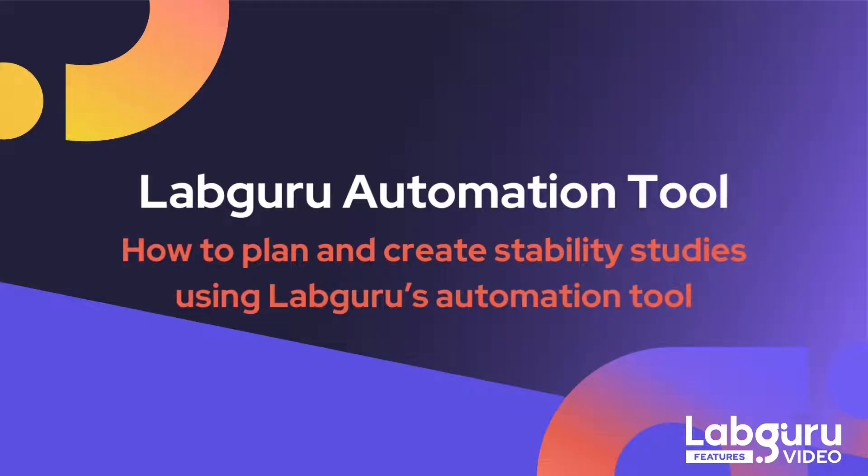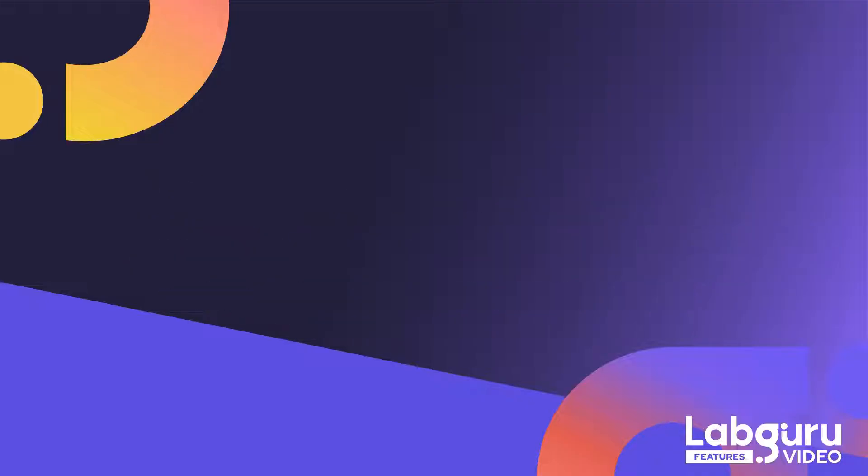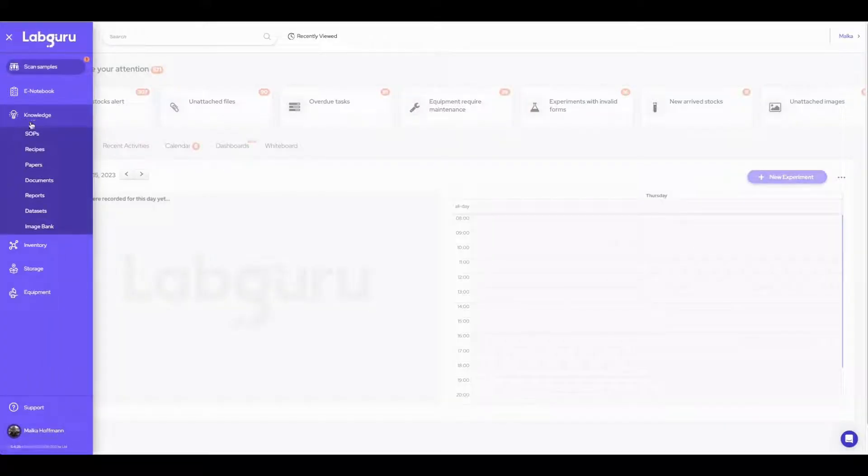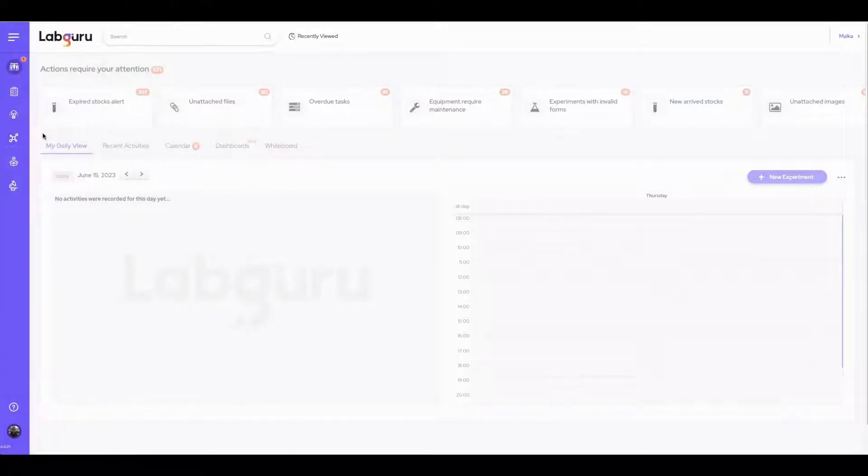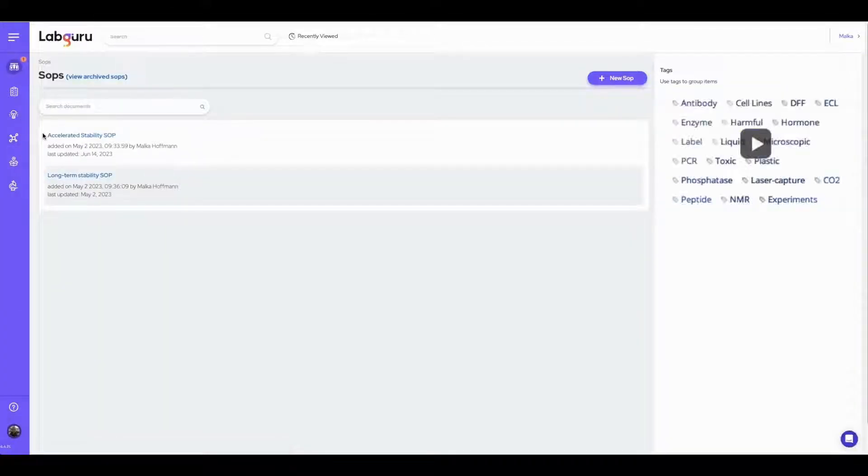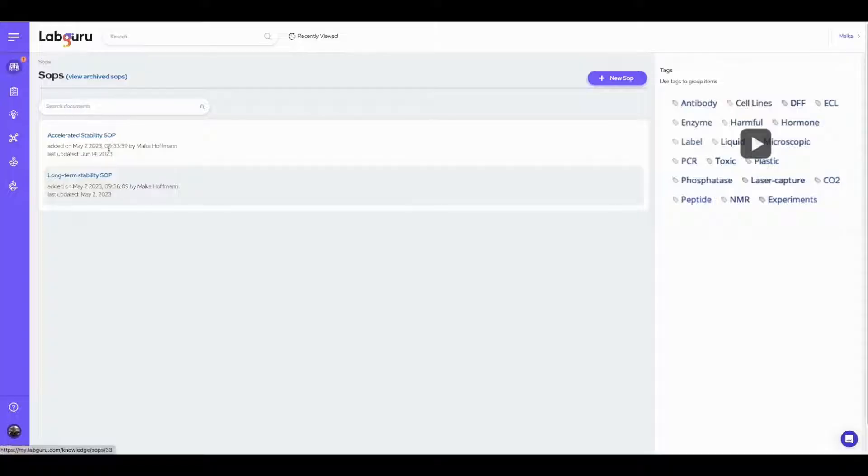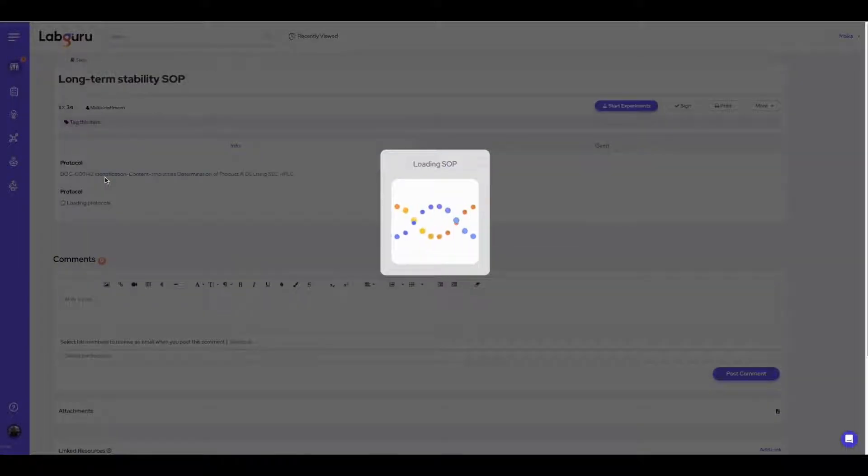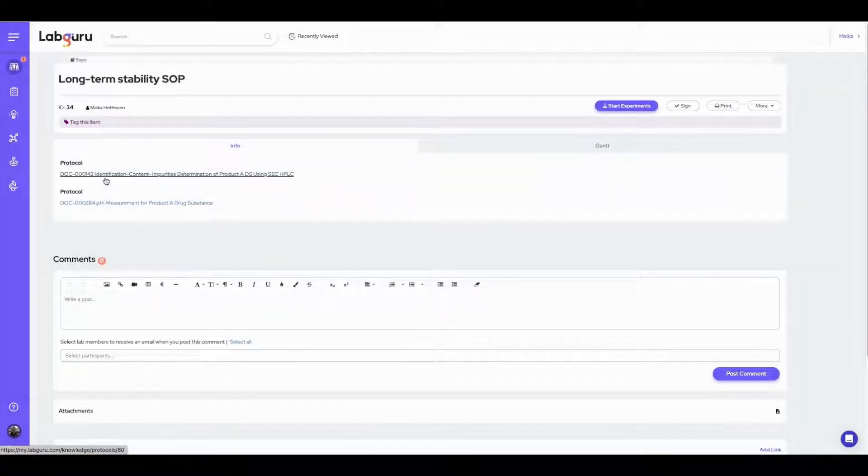Welcome to today's demonstration on how to automate the creation of stability experiments according to a predefined stability plan. Stability testing requires planning ahead according to a predefined stability plan that is unique for each product. In LabGuru you can create SOPs for stability programs that include all required stability protocols. This ensures consistent and standardized procedures for your stability studies.